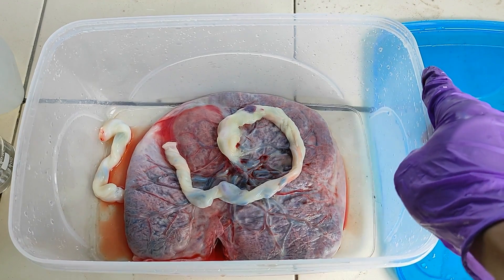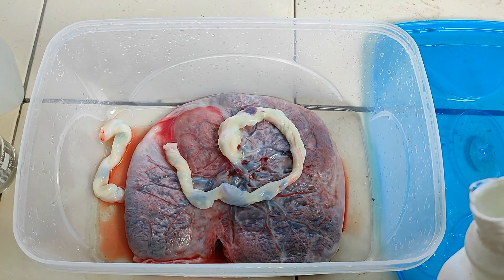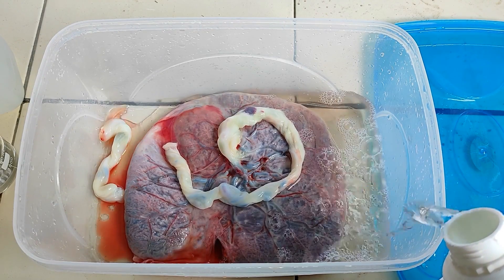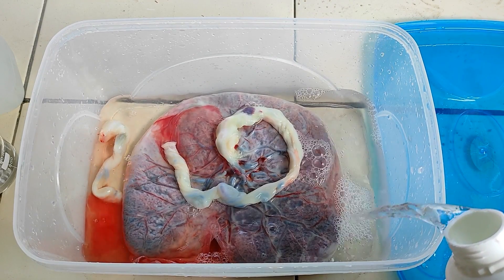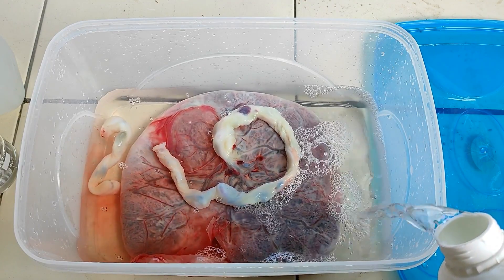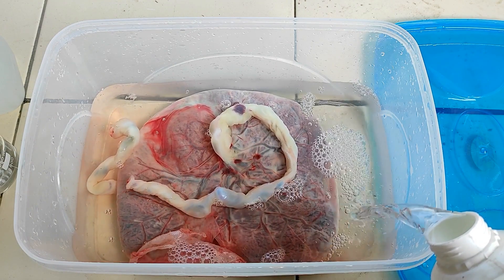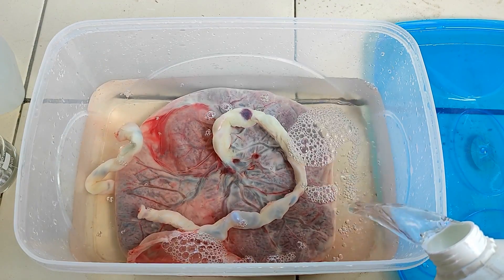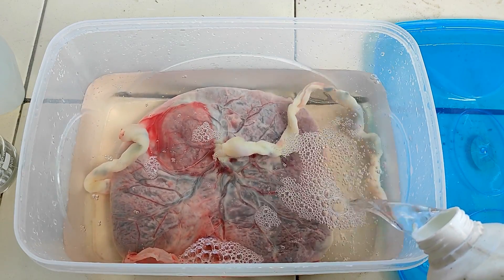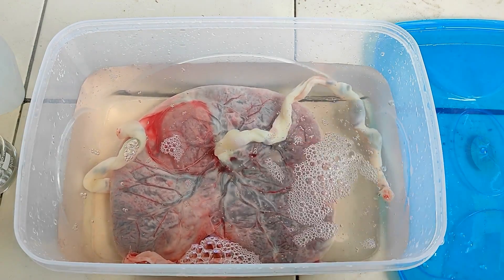Take a container with a tight-fitting lid, which is large enough to loosely accommodate both the placenta and at least twice its volume of the fixative liquid. Place the already injected specimen into the container and carefully pour in the fixative of the same type and concentration used for injection — in this case, 8% formalin. If buffered formalin was used to inject the placenta, make sure to use buffered formalin in this step as well. The amount of fixative must be at least twice the volume of the organ itself. Allow the placenta to soak in the formalin fixative for at least a week to ensure thorough fixation.